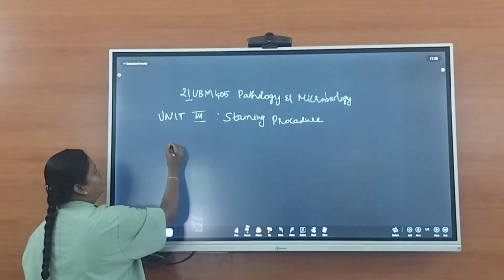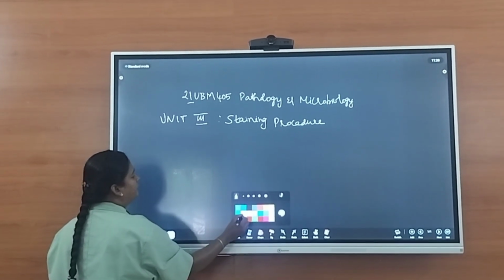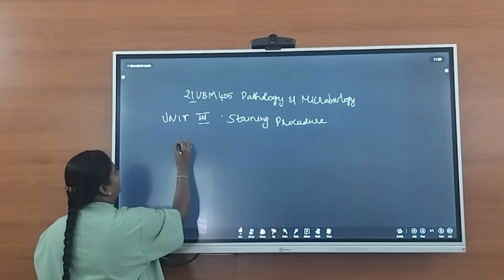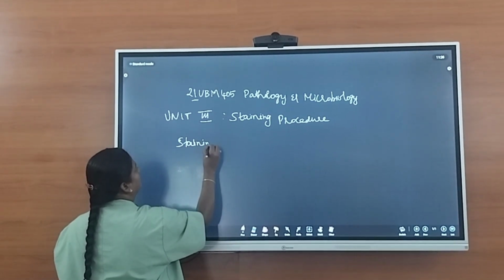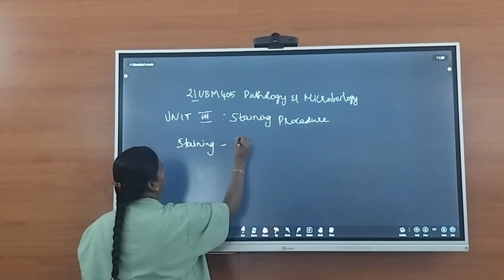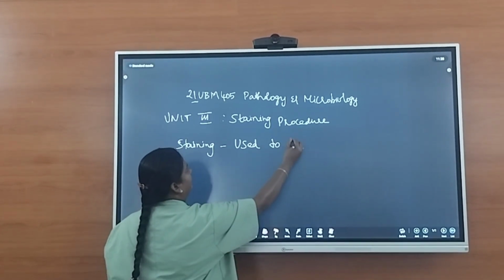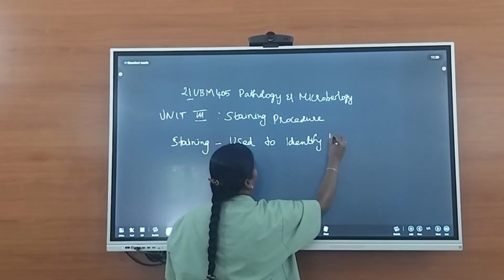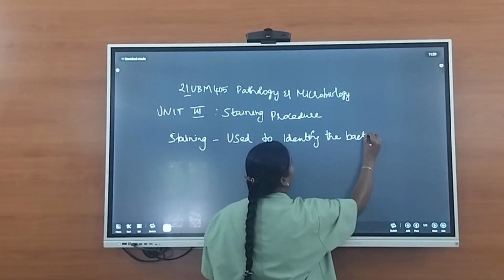So what is the staining used for? Staining is used to identify the bacteria.